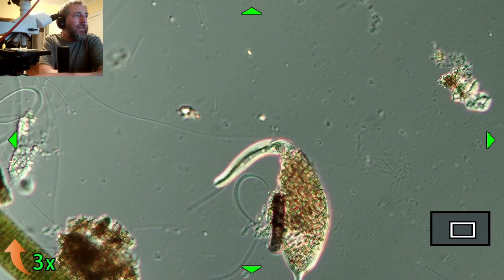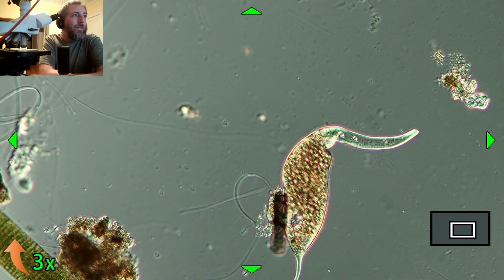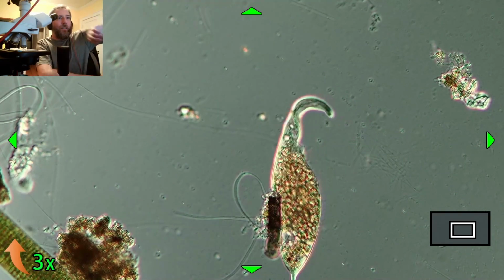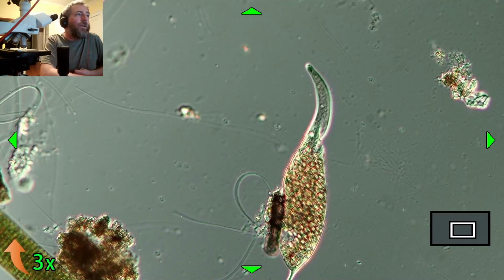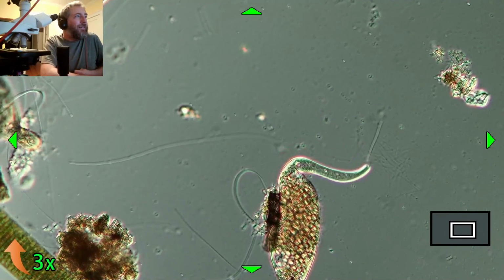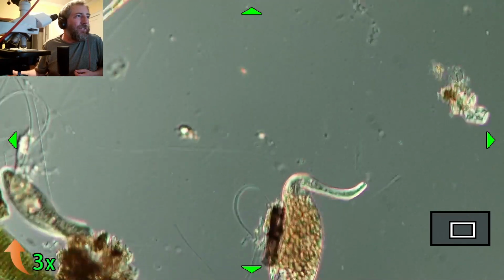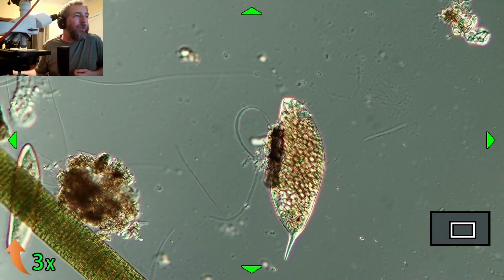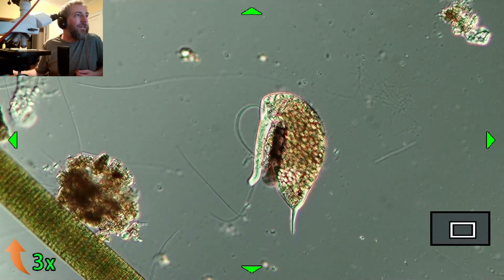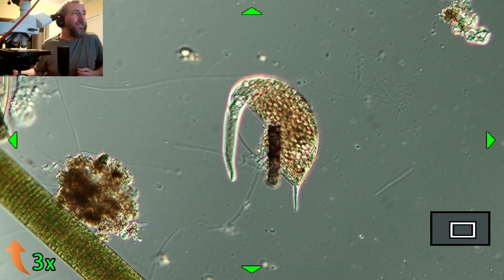And that's their primary mode of movement with respect to traveling from one place to another. If they really get going, sometimes they'll spin their body and just sort of funnel through the water very quickly. But this one's been just sort of parked, which is amazing. I love it when they just park and let me take a look at them. A lot of times they'll just be zipping around and you won't be able to keep up with them. They're moving so fast. A lot of these little guys can really put on some speed if they need to. Yeah, it's got like a proboscis. It's pretty cool.